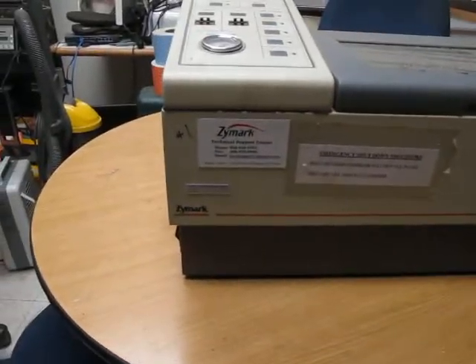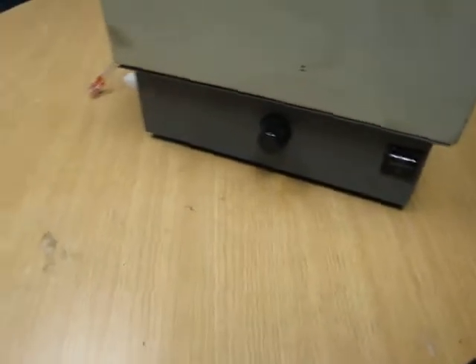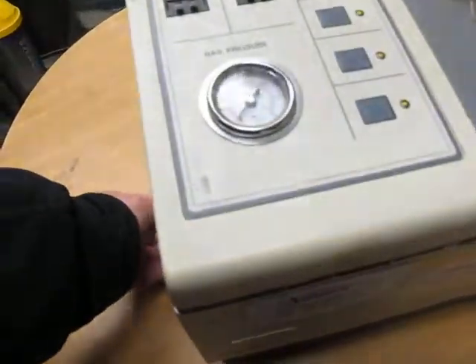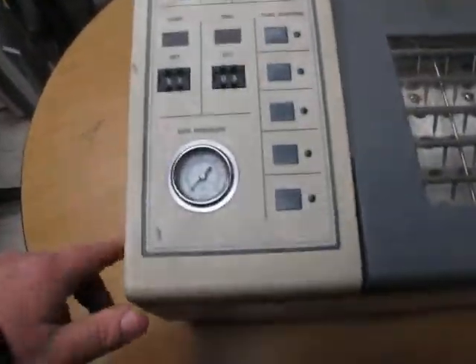This is a Zmark TurboVap LV evaporator. It's got a gas inlet and this is a regulator on this side. The regulator is a little loose. You can see the thing powers up — we obviously don't have any gas pressure.